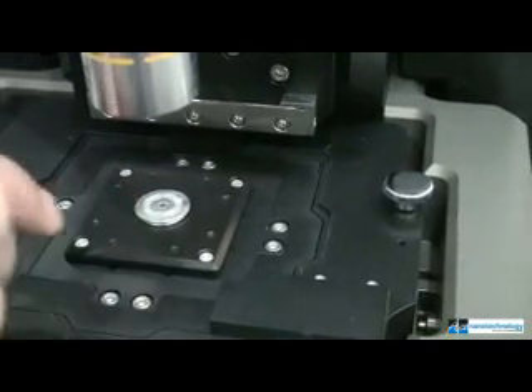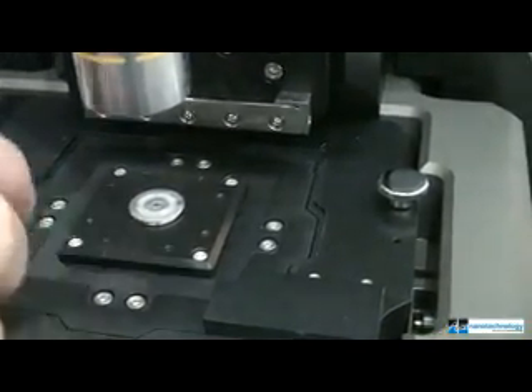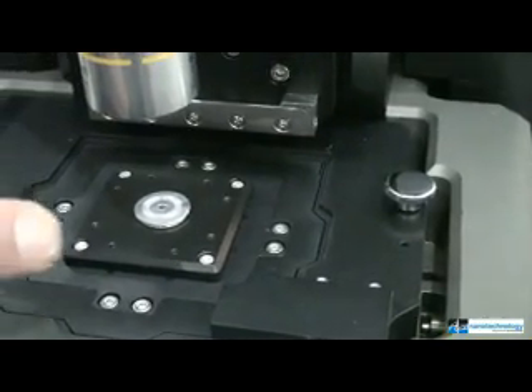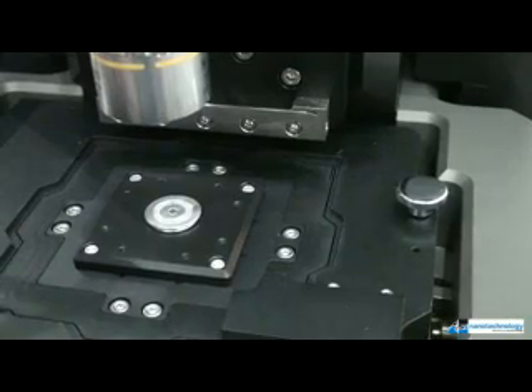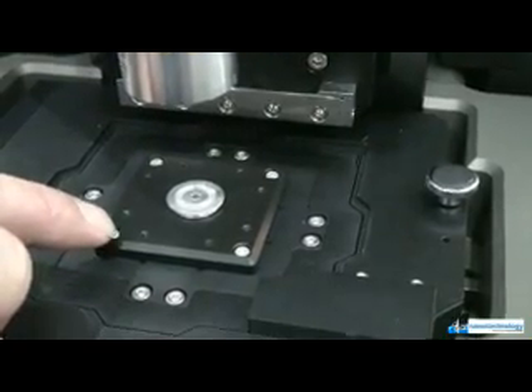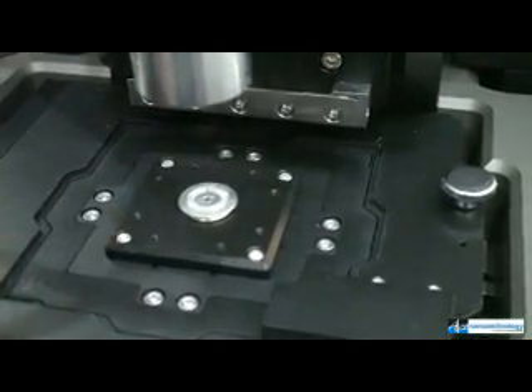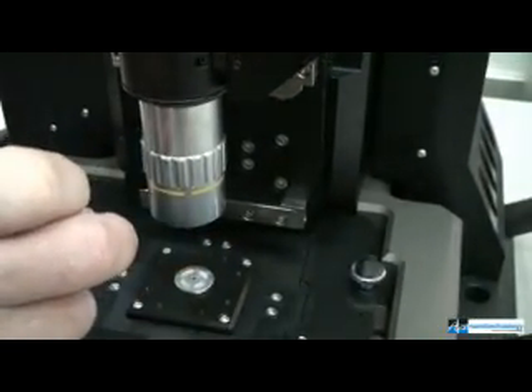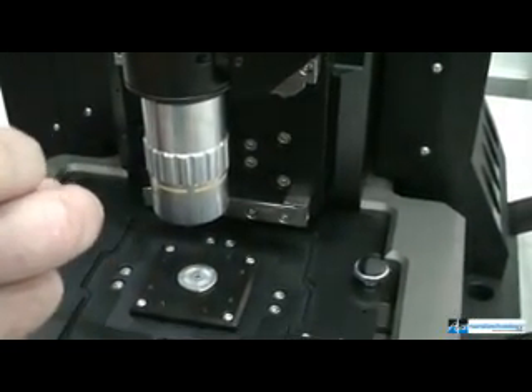For simple AFM techniques, there is a small sample mount. You can look at small samples as well as larger samples — a microscope slide could easily sit on the stage. For near-field techniques, the scanner plate is actually removable, providing a pass-through for the light path for doing transmission experiments.